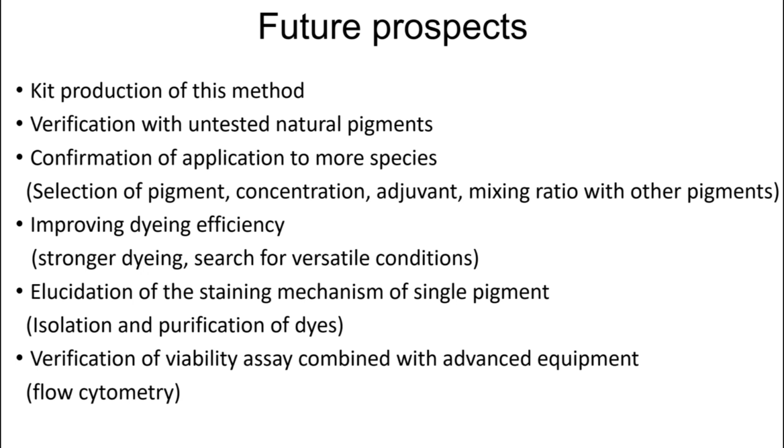In order to make this method into a kit, we will search for untested natural pigments and staining conditions, and test with many cell types. In addition, we would like to elucidate the mechanism of staining and perform viability assay in combination with advanced equipment.